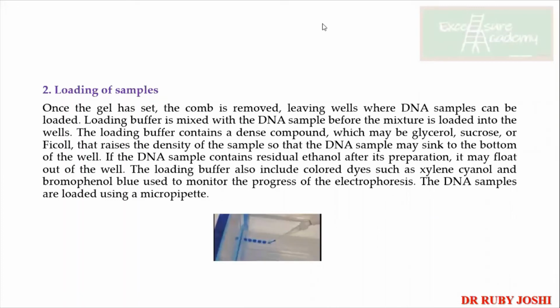Okay, so then what happens, like as I was saying, there are few people who would like to make it to 10 microliter and then it becomes easy for them to load. So it's okay, you can add little water, not more, of course. Otherwise, it will get more diluted. Okay, so this is how you're going to load the sample.